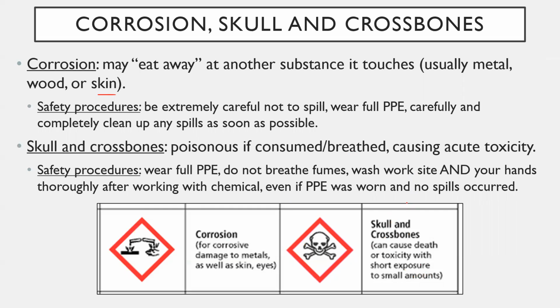It would cause serious damage to you, could even kill you if you drank enough of it. So be really careful with these ones. For some safety procedures, wear full PPE. Do not breathe the fumes. Certain things you'd have to use a fume hood. Don't worry, we're not going to work with anything like that.